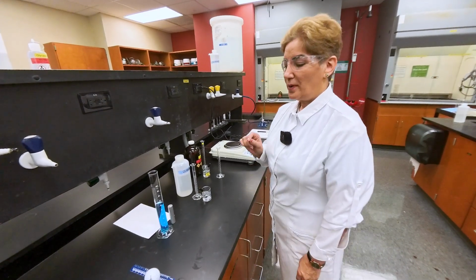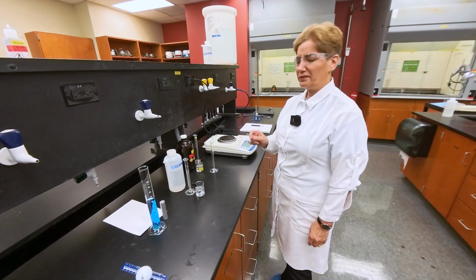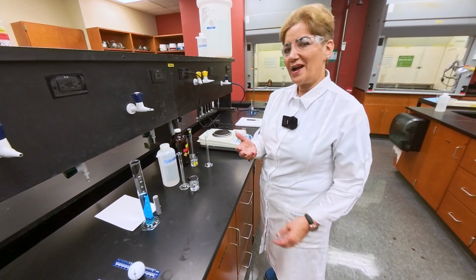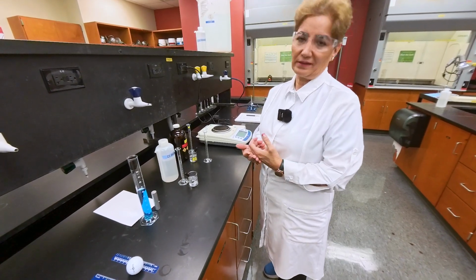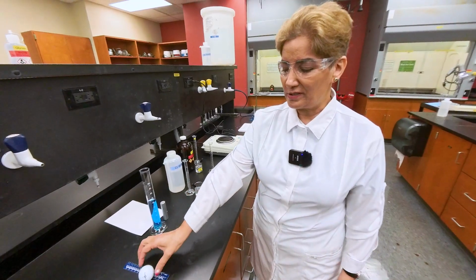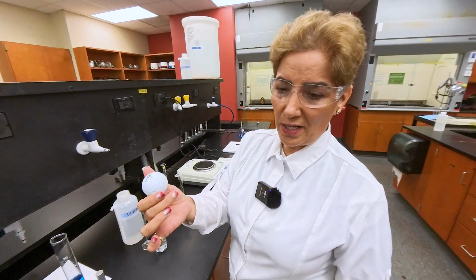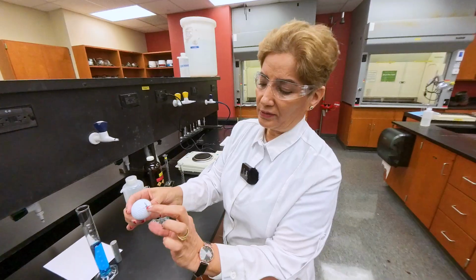Okay, part 3 of the experiment 1, we are going to measure density for different solids and liquids. When we measure density, because it's an indirect measurement, we have to measure mass, we measure the volume, and we calculate density basically. The first item we are going to measure the density of is a golf ball. For that, we need the mass of the golf ball and we need the volume. To measure the volume, we need the diameter, we need the radius.